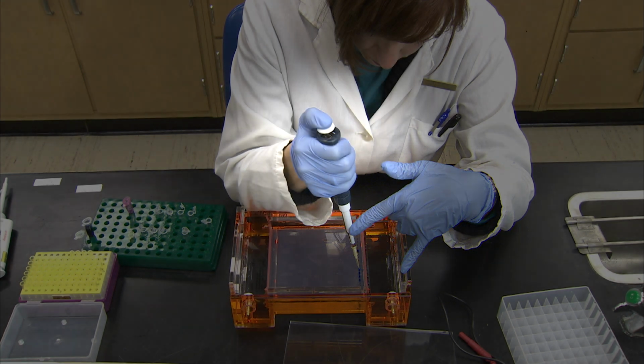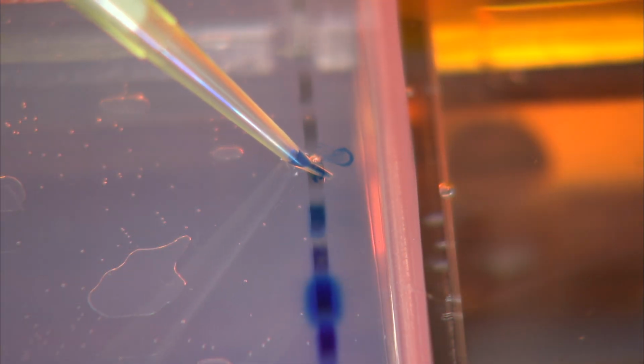Ensure you do not dispense the sample down to the second stop, as this will force an air bubble into the well, which can disperse the sample as it floats to the top of the well.